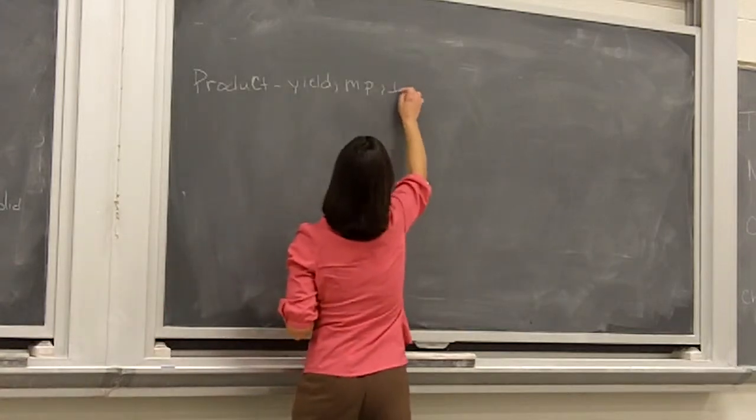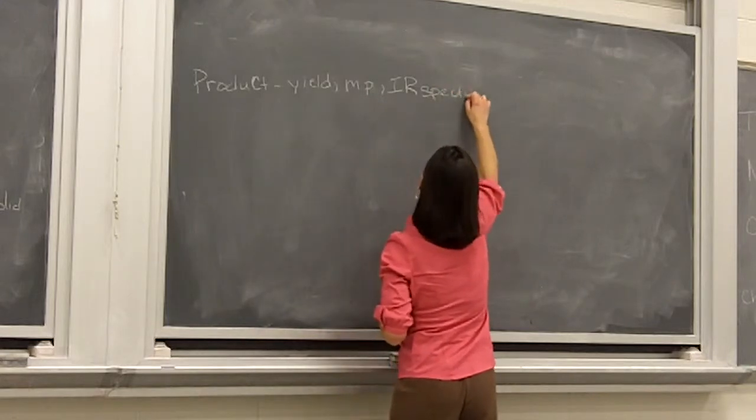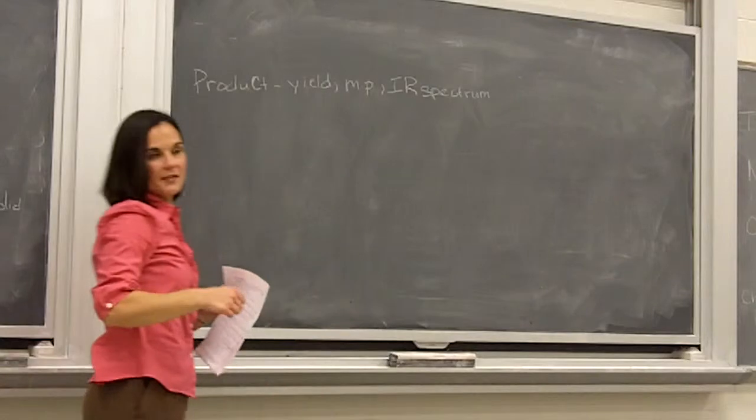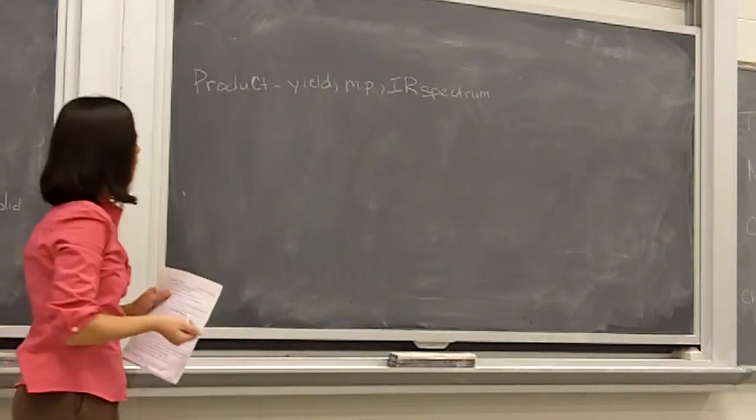You also want your IR spectrum. And you're going to collect it just like you did with polystyrene. The solid's going to go directly on the ATR. Just make sure then you pull the anvil down for collecting the spectrum, okay?